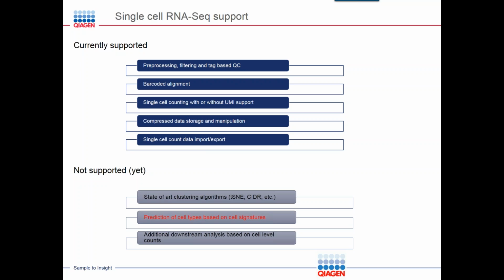What's not supported yet are those state-of-the-art clustering algorithms. We have seen a lot of new algorithms that are designed for this single-cell data. They are usually available in open source tools. We still have plans to integrate these algorithms through our engine so that the user can easily get this clustering through server-based integration.